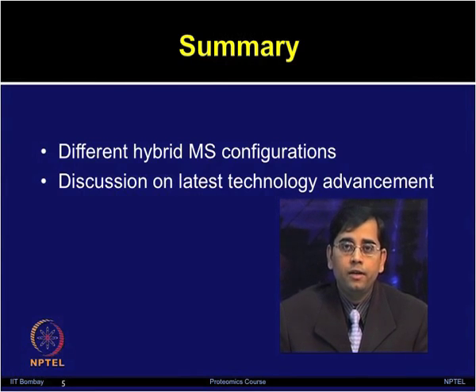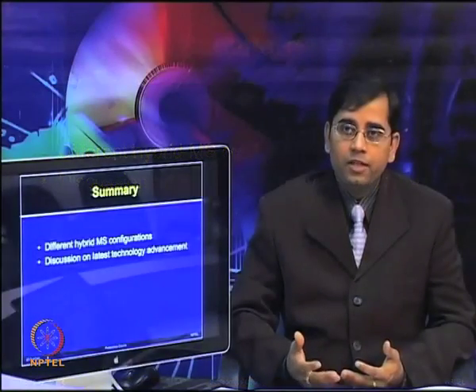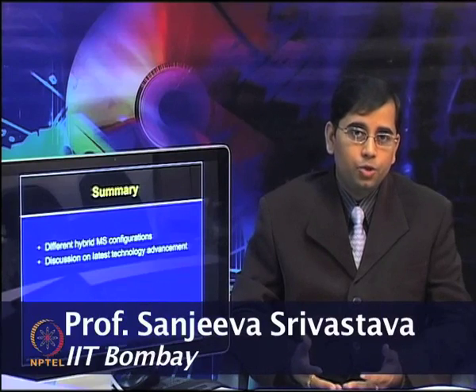These two interviews were mainly intended to showcase different types of hybrid MS configurations available and the latest technologies which are trying to overcome HPLC based methods and their limitations. There are many other good manufacturers available, and these are just two examples to showcase different types of advancement.